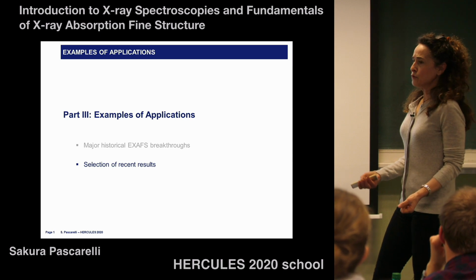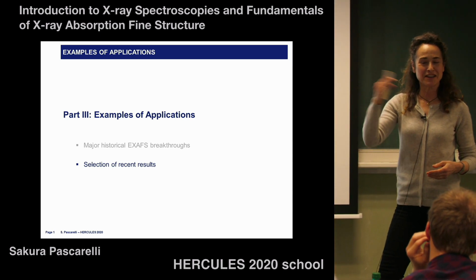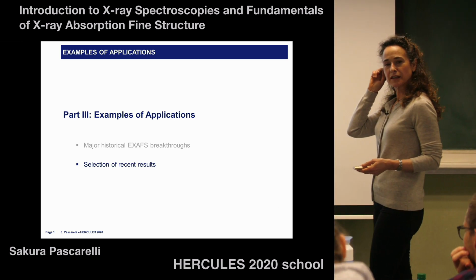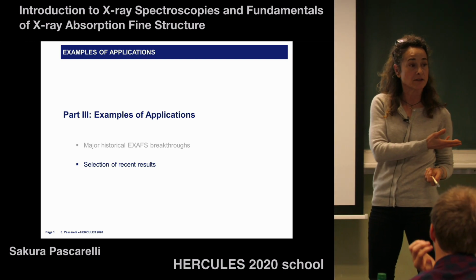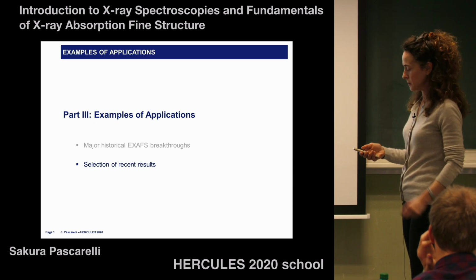So now I'm moving fast forward 1 century. No, we go to the next century, 21st century. So I'm going to show you a little bit of things that we do today. Most of these examples come from the ESRF, but not all of them. I've picked also some things from other synchrotrons.